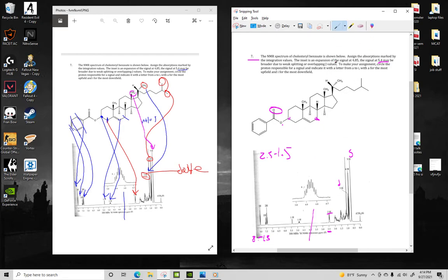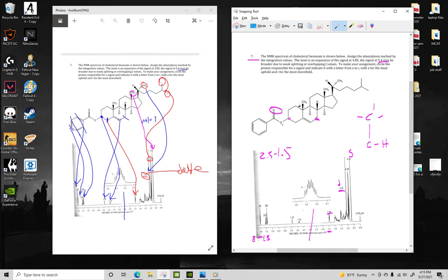Okay. Then right here, we have three hydrogens, and it's a doublet. So that means we have a methyl group bound to a carbon with one hydrogen. The only place in the molecule that occurs is these right here. So these hydrogens line up with this peak right there.